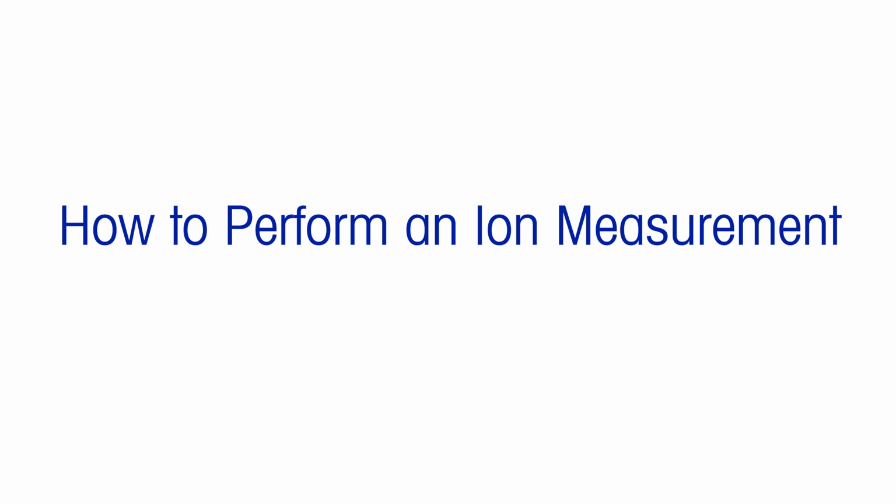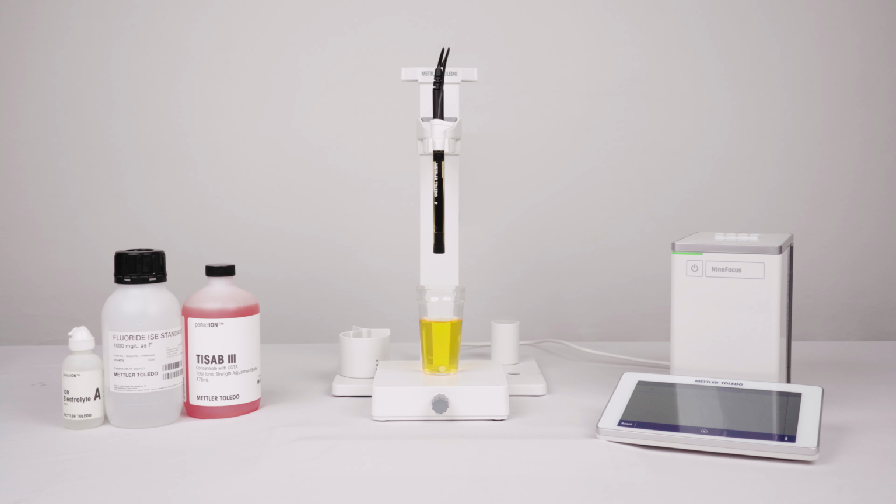How to perform an ion measurement. Welcome to this ion measurement video of NineFocus. NineFocus is fully set up with the analog module inserted in channel 2.